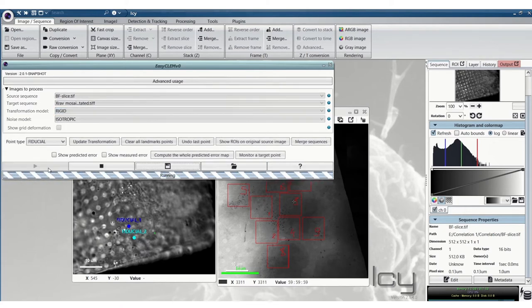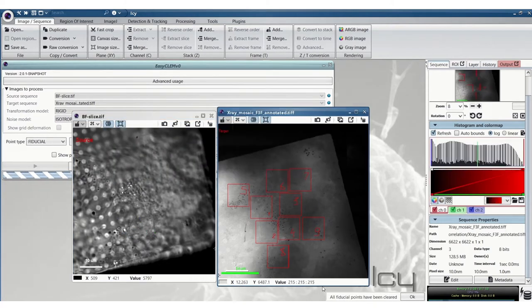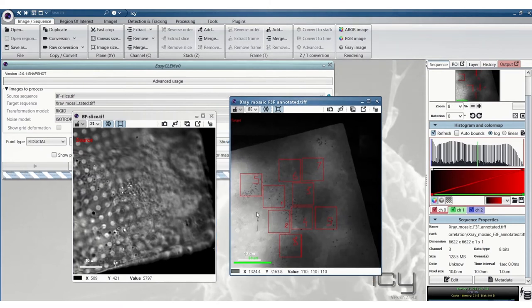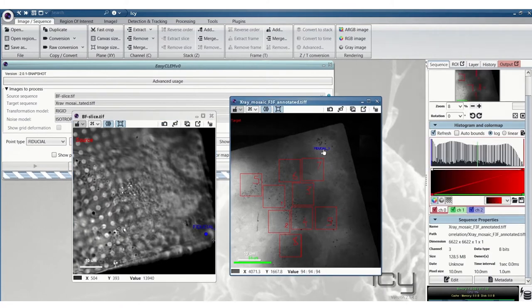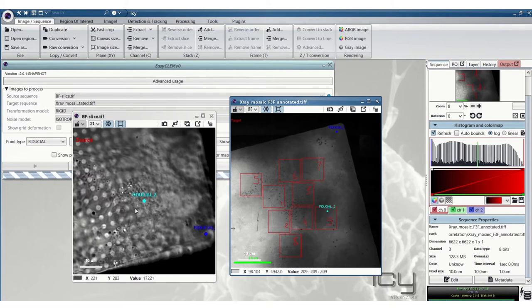Then we'll open EC Clem and in this case now the brightfield image is the source and the X-ray mosaic is the target. We can press clear landmark points to get rid of any previously placed fiducials. Here if it's quite difficult to spot any similar features then you can do some course registration first.